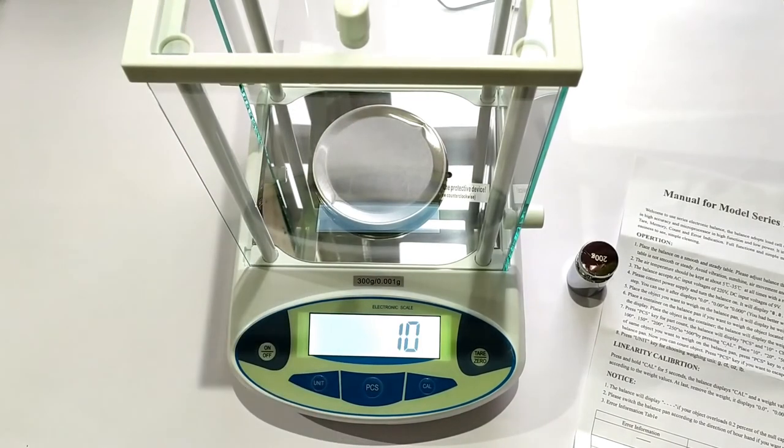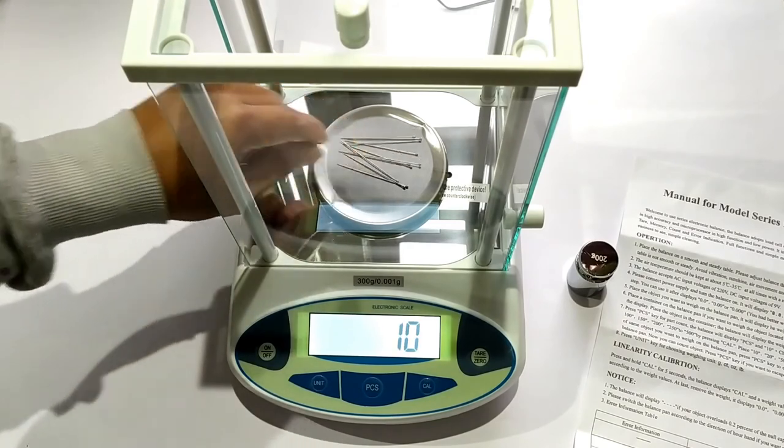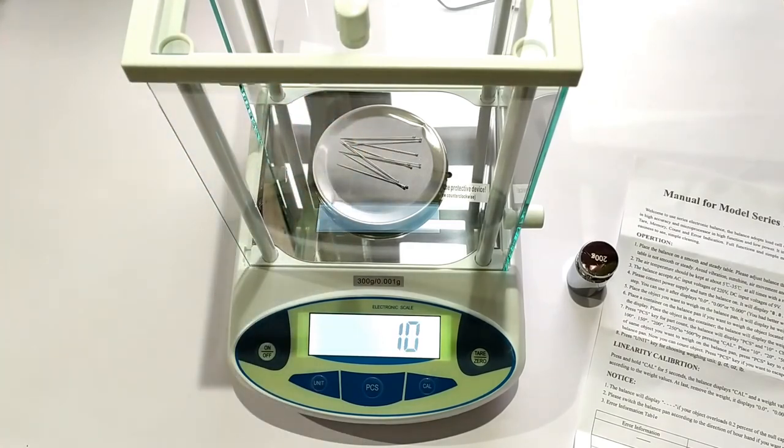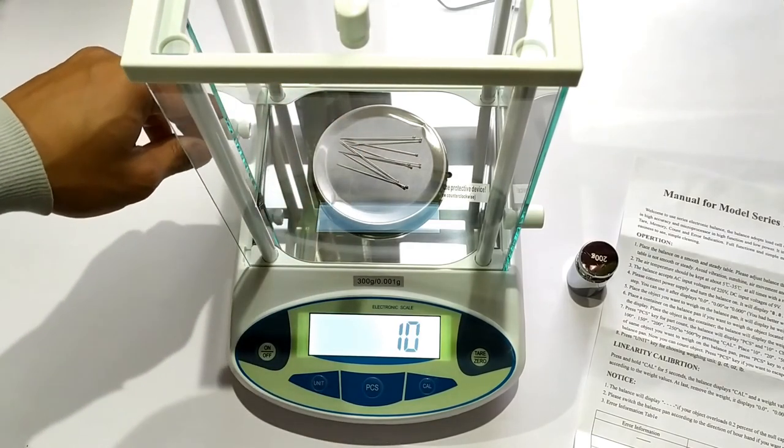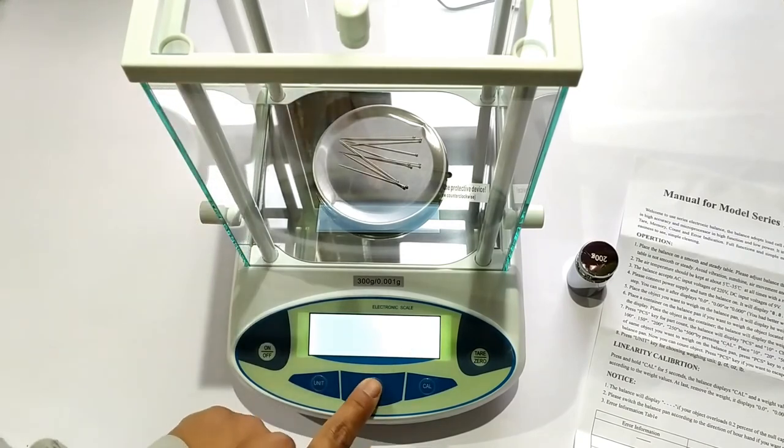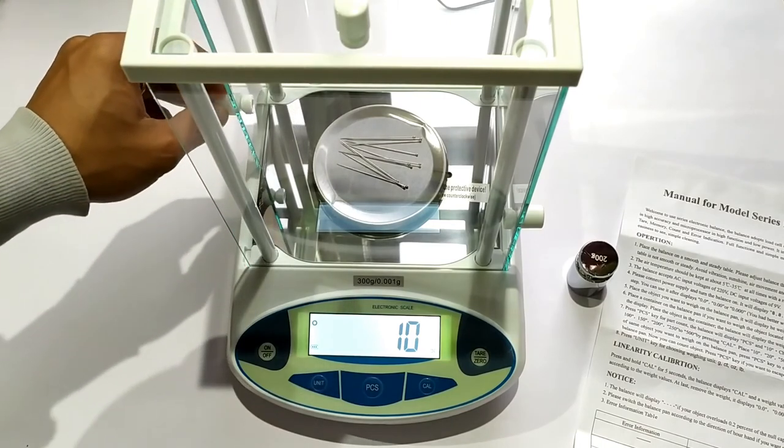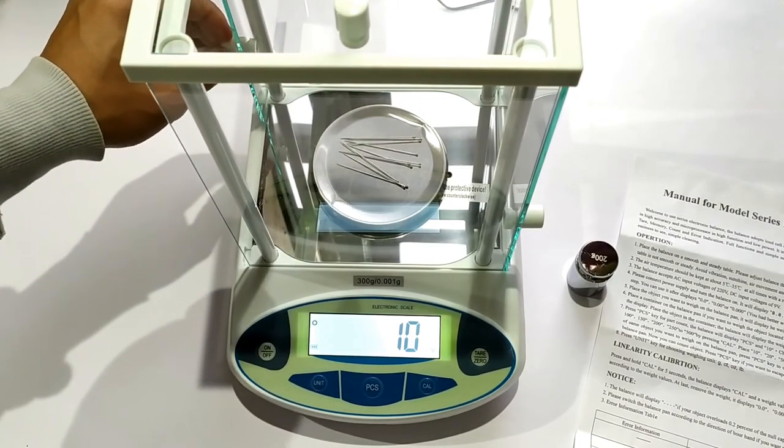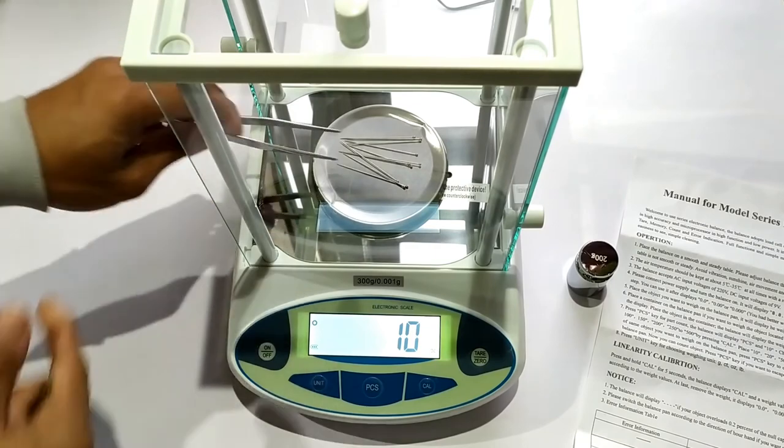Now we place exactly 10 counts of the item that we would want to count. We then close the weighing chamber and allow it to stabilize, and then press the PCS button again. Once the blinking stops, we carefully open the chamber, remove the items completely and then proceed with counting the same items according to our choice.